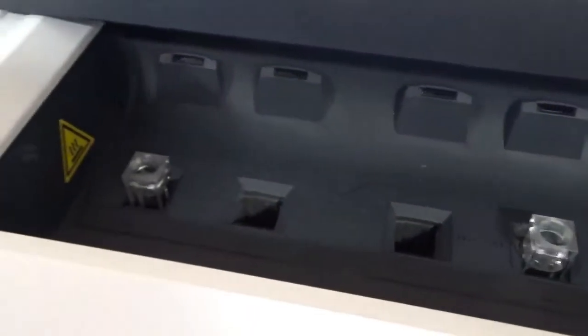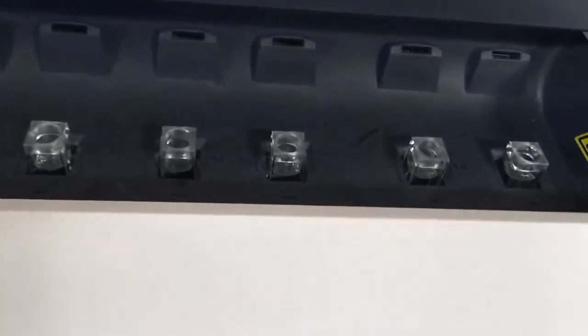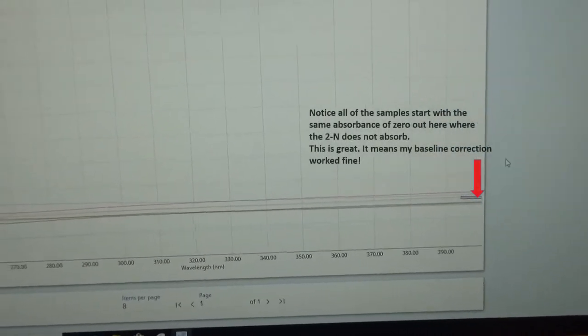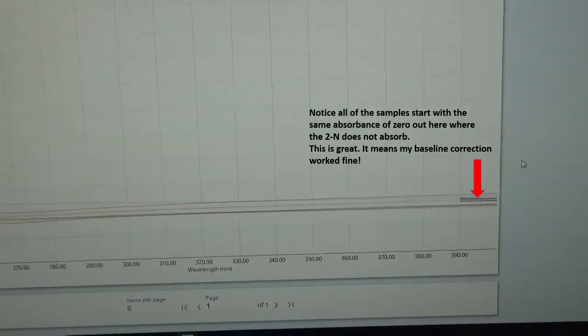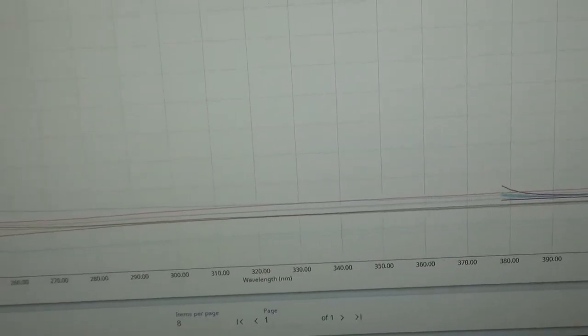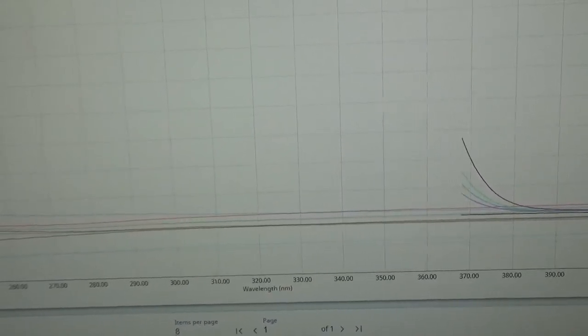Okay, so I've just replaced the distilled water from 1, 2, A, B, and C, those solutions, with the actual solutions, and of course left the reference distilled water alone. Now I'm going to go back here, and I'm going to click OK to run these samples all at once. You can see all the samples are doing something slightly different.